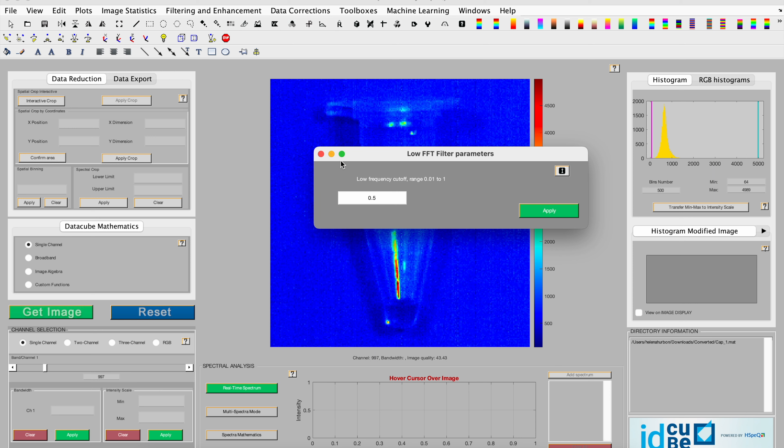You'll be asked to enter a low frequency cutoff ranging between 0.01 to 1. A higher value indicates that the high frequencies will be removed prior to the reconstructing, resulting in the low-frequency image where 50% of the high frequencies are cut.